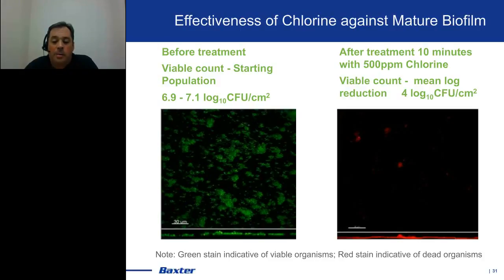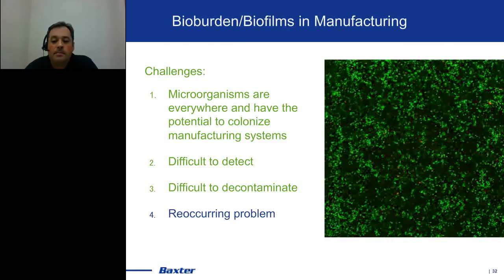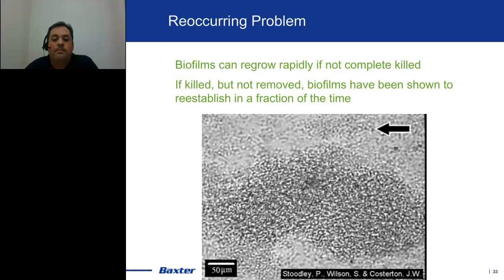After the preparations, they were treated with live/dead stain, which essentially stains live organisms green and dead organisms red. You can see there's a significant log reduction. And to me, just as importantly, you can see a significant removal as well, which actually brings us into the next theme, which is the potential for biofilms being a reoccurring problem.